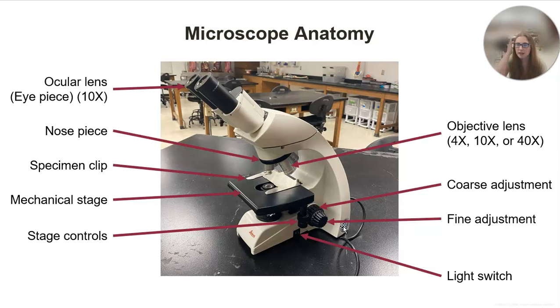Whenever you're using the microscope slides, you always want to start by using the coarse adjustment to get that slide moving up within your field of vision. And then as soon as you start seeing stuff, you switch to the fine adjustment so that you move the stage more slowly, so that you can get that slide right where you want it for the crispest image.